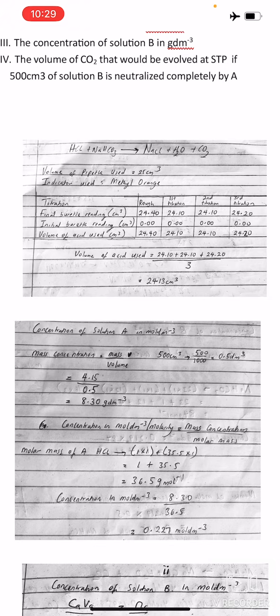And this volume of acid used, you can ask your teacher about the titre value, the volume of acid used for your own school. This value here is not for general use.